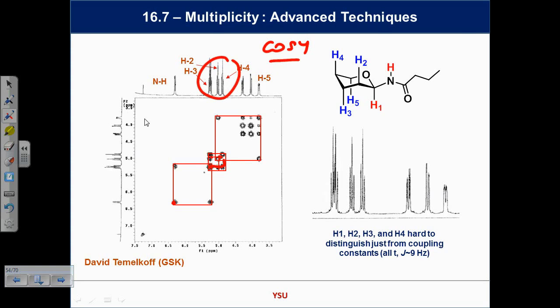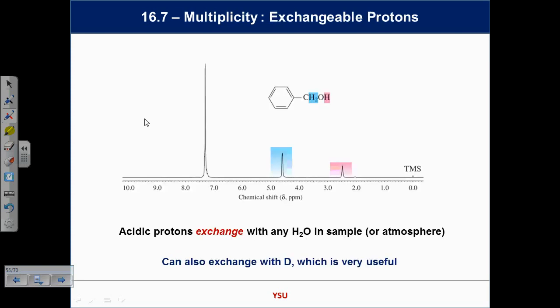So we've dealt with proton NMR spectroscopy apart from one thing, we've touched the surface and we've got some idea now what it's useful for. We now need to worry about some problems and how to use those problems to our benefit. If you spend time in Washington, D.C., like I did before I came here, it gets very, very humid. Arizona's dry, Washington's humid. Now, some molecules which contain things like alcohols or NH2 groups, I need to write that on here as well, any NH protons, those spectra can be problematic.